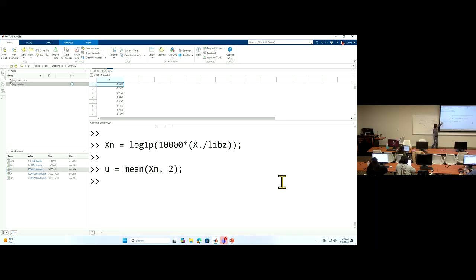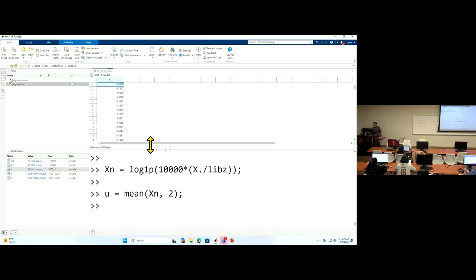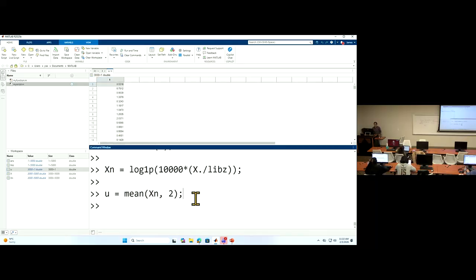We can see the first gene has a 0.5 expression average across those cells. Gene number 8 is 1.2, so higher expression. Gene number 9 has a 2.0, so higher.